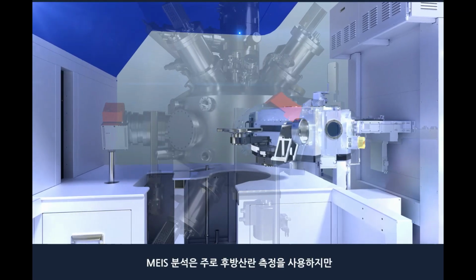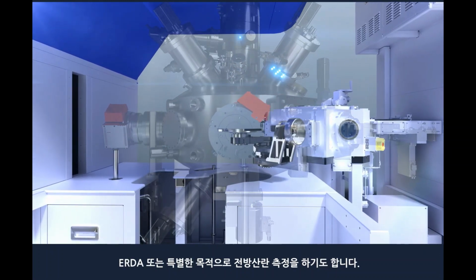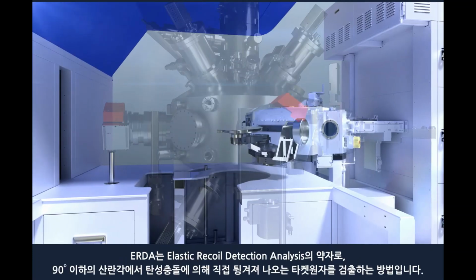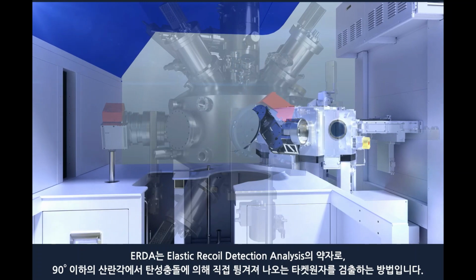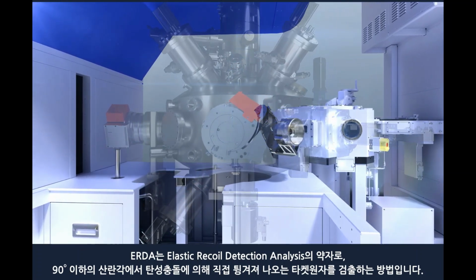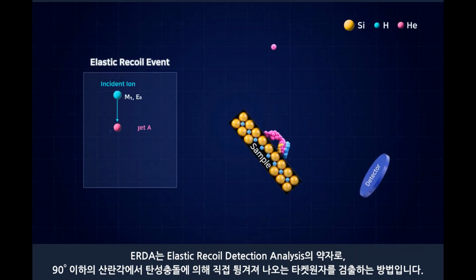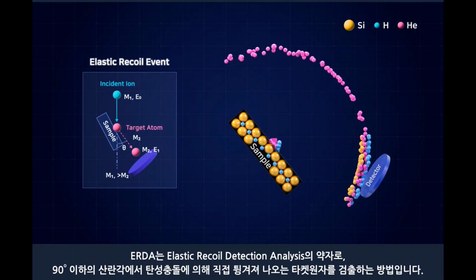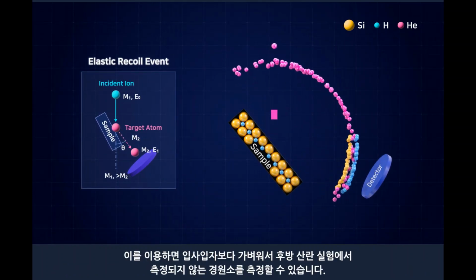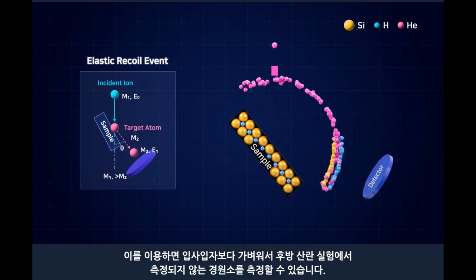MEIS analysis mainly uses backscatter measurements. ERDA or forward recoil scattering measurement for special purpose are also used. ERDA stands for Elastic Recoil Detection Analysis. This method detects target atoms recoiling directly at scattering angles of 90 degrees or less via elastic collisions. This method can be used to measure atoms lighter than the incident ions that are not measured in backscattering experiments.